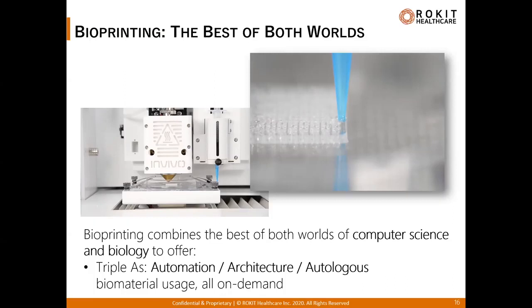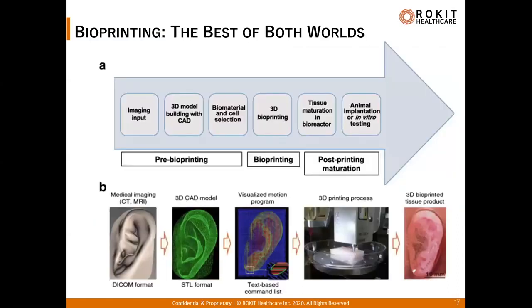And perhaps the biggest benefit of bioprinting may be the use of autologous materials in this platform technology. Ultimately, if the bioprinter were to go beyond the bench to life in the hospital, its ability to print in vivo autologous solutions directly from the patient into customized tissue for implants would be a revolution for biomedicine.